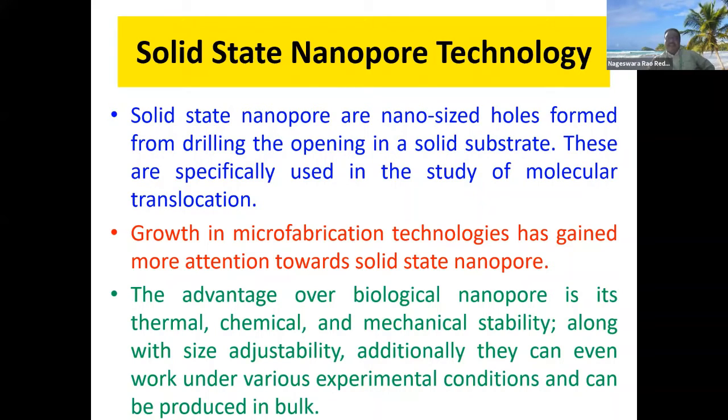We have thermal stability, that is, it is heat resistant. It is stable even at high temperatures. Chemical stability, it is resistant to certain chemicals. Most of the chemicals cannot harm this. Okay, it is resistant to mechanical stress, mechanical stability. So thermal, chemical, and mechanical stability are there.